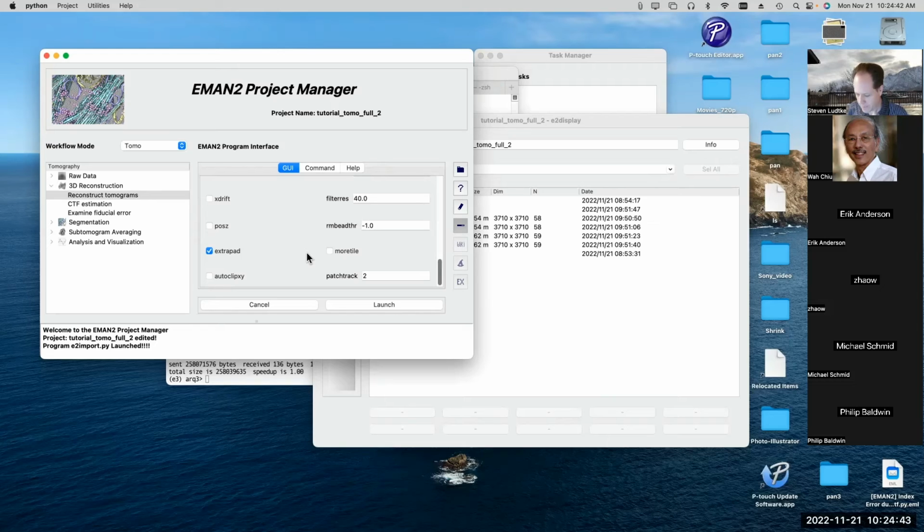Because up to now, everyone, or at least the people that I've talked to, has said, "Oh, IMOD gives you a really good reconstruction, better than almost all of the other ones." IMOD has been tuned over the years to filter and produce things which look a particular way, and people are very accustomed to looking at things that way, and they think that anything that doesn't look exactly like that must be worse.